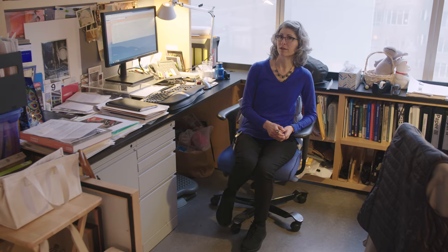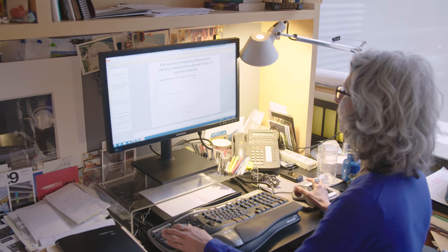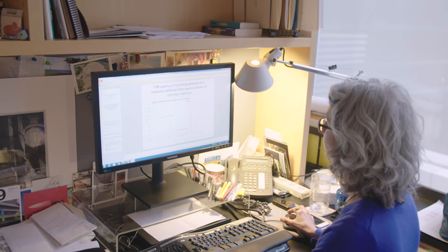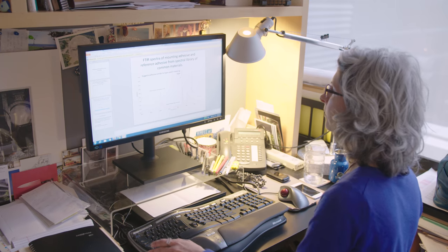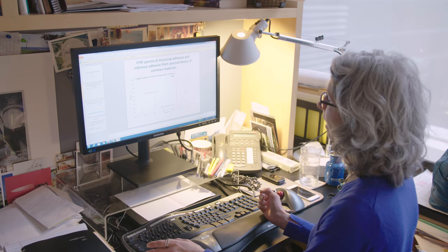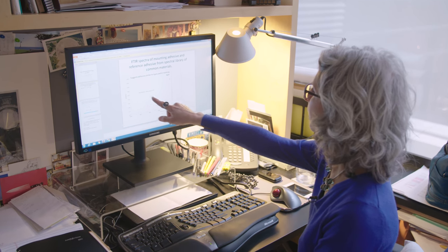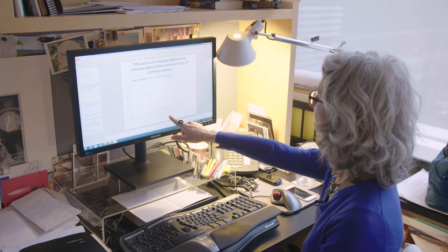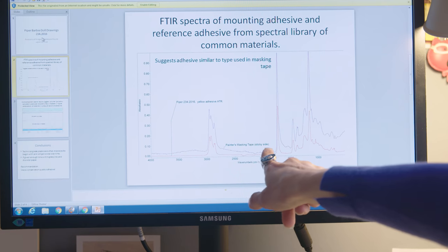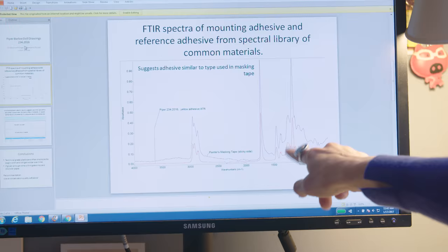Our scientists took a sample of the adhesive we had gotten from the drawing and ran some analysis. He ran Fourier transform infrared spectroscopy on the sample and found that it is similar to an adhesive used in masking tape. You can see here — this red line on the spectra is the adhesive from the Piper, and this purple line is a reference of painter's masking tape. You can see that the peaks match fairly well.